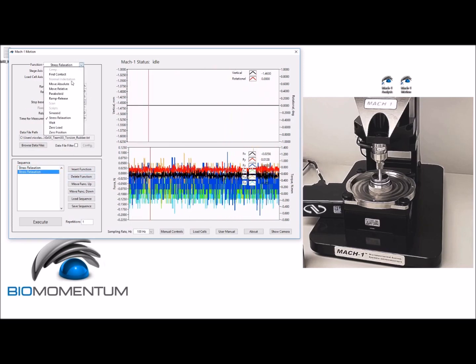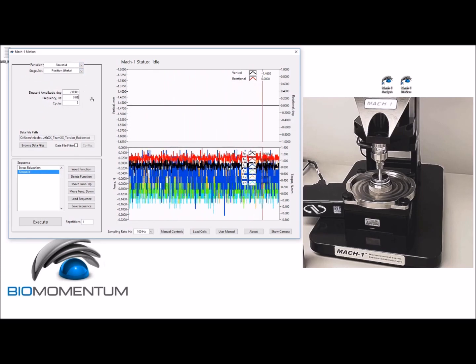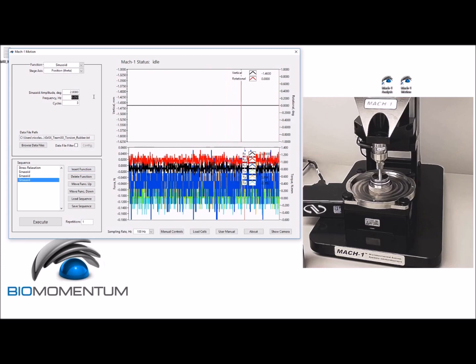Such as 0.01, 0.05, 0.1, 0.5, 1, and 2 hertz.